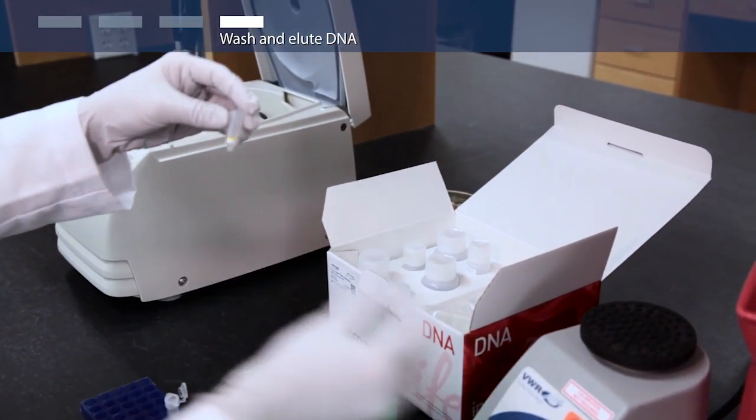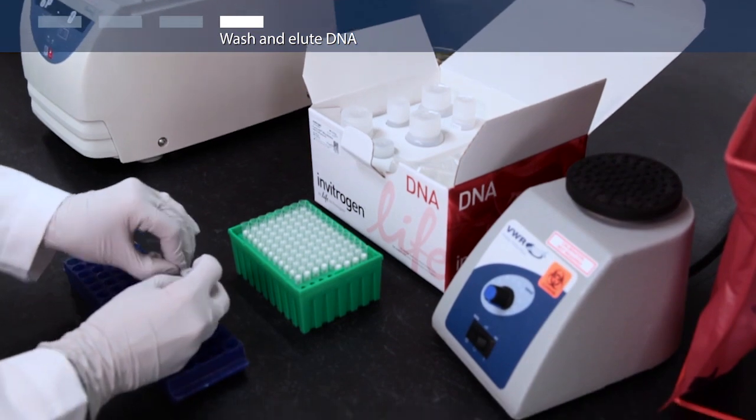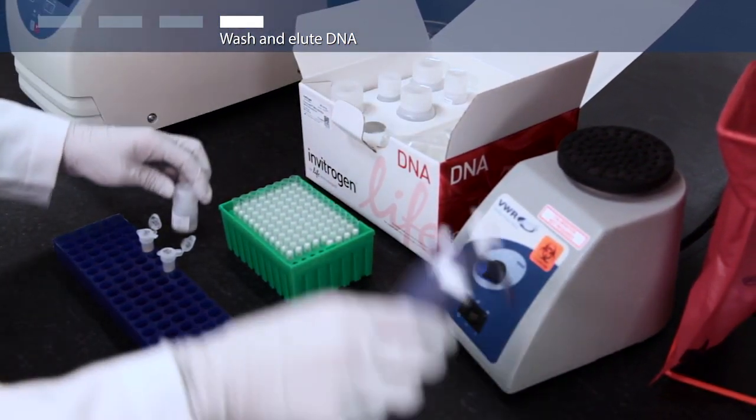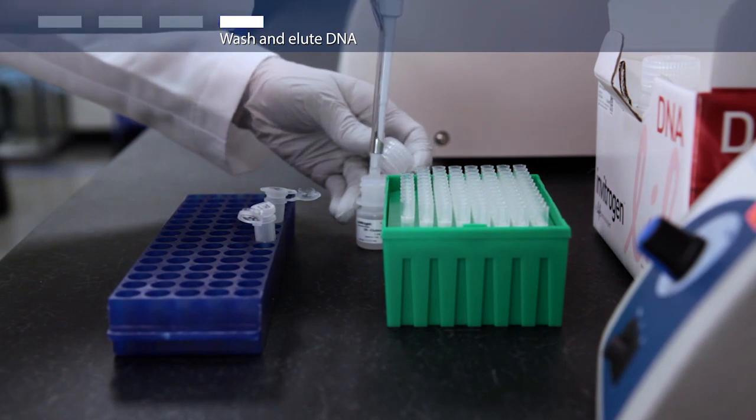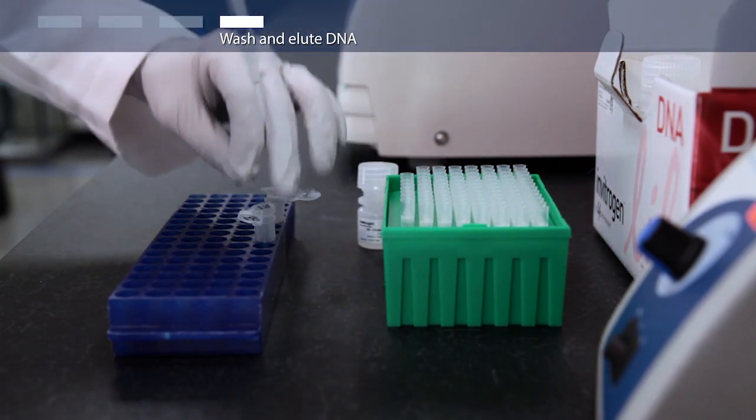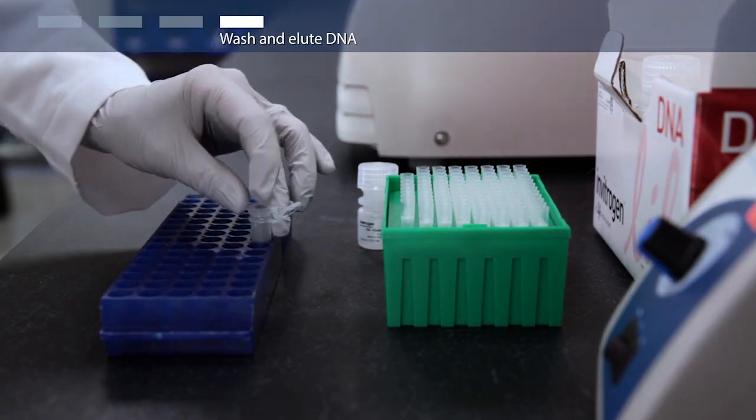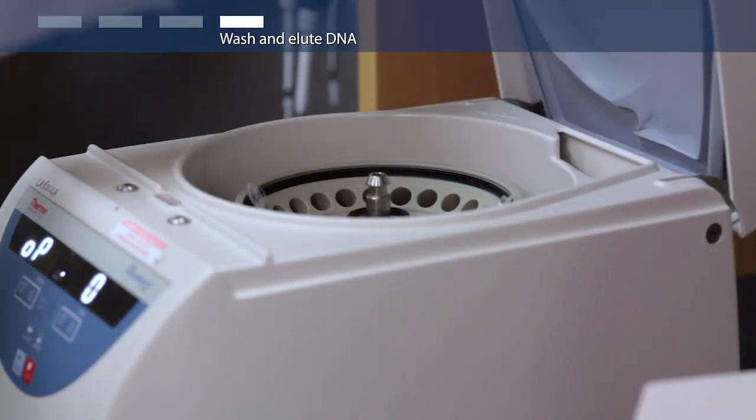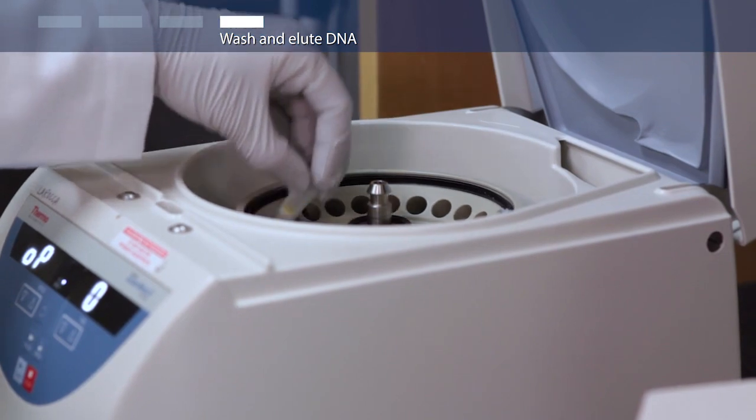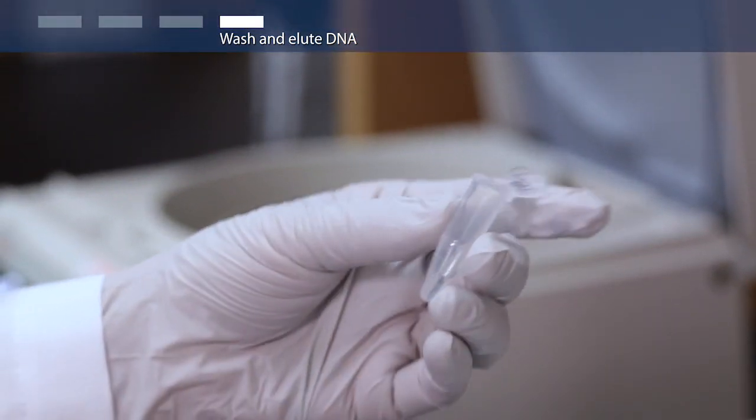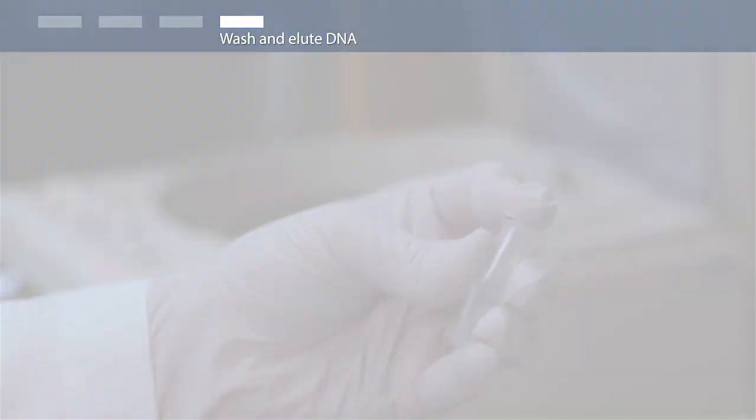Now, you'll elute the DNA by placing the spin column in a clean tube, adding 100 microliters of elution buffer and leaving at room temperature for 1 minute. Centrifuge for 1 minute at 14,000 G and discard the column. Your purified DNA is in the tube and ready for immediate use or storage.